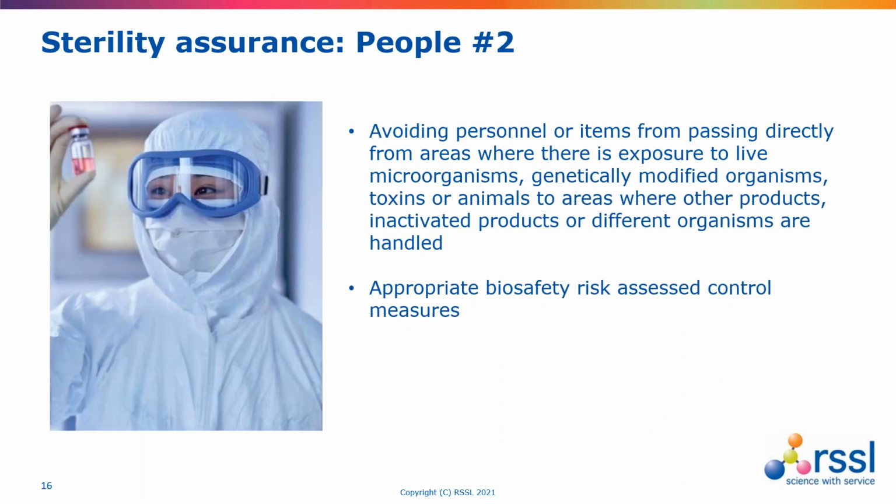Then these concepts should also extend to the strict controls in place for the movement of people. So for example, avoiding personnel or the transfer of items passing directly from areas where there is exposure of live microorganisms or genetically modified organisms, toxins or animals into areas where other products are being prepared, or products that have already been inactivated, or where different organisms are being handled.